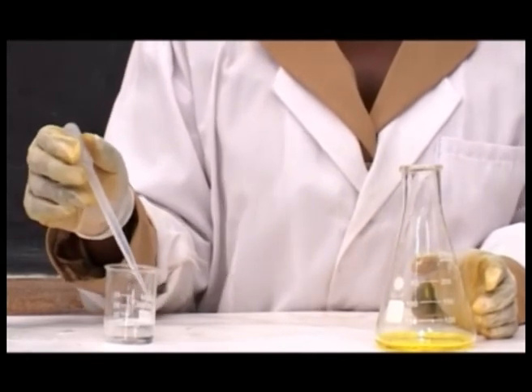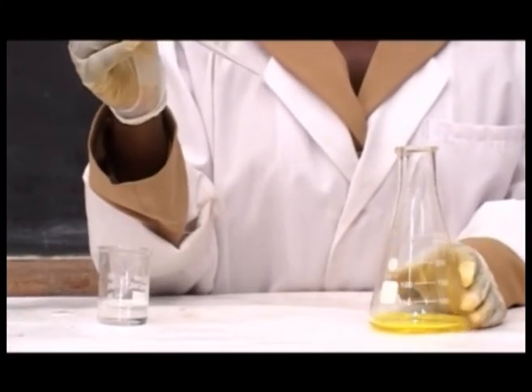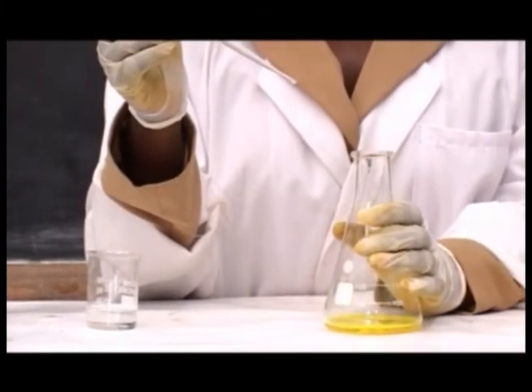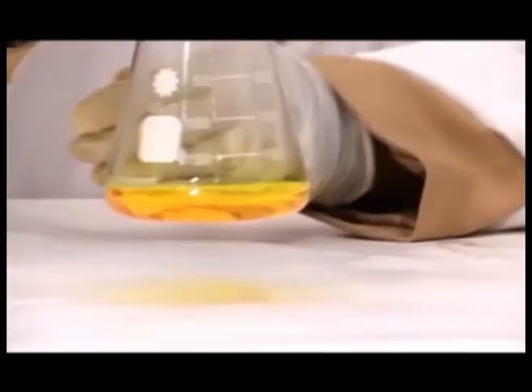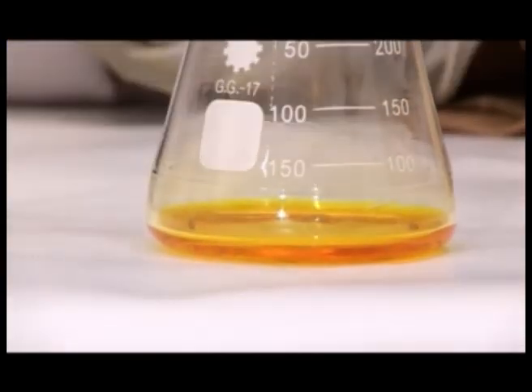Take 2 ml of 2 molar hydrochloric acid and add it to the chromate solution. You can see the color of the solution is orange.